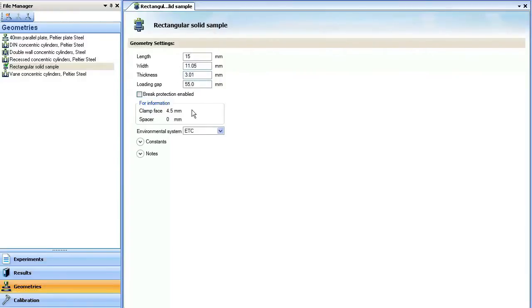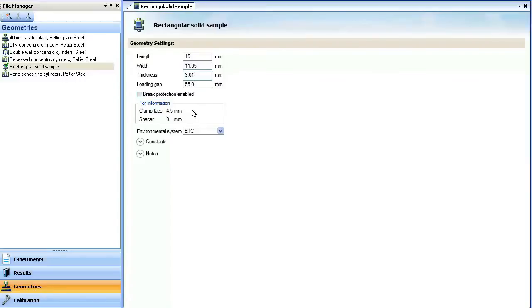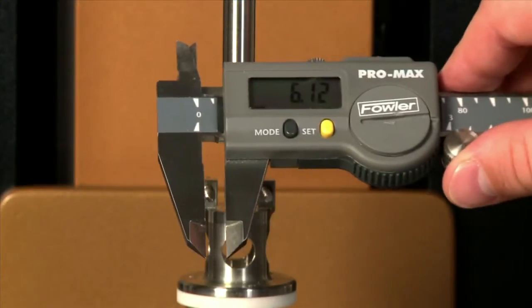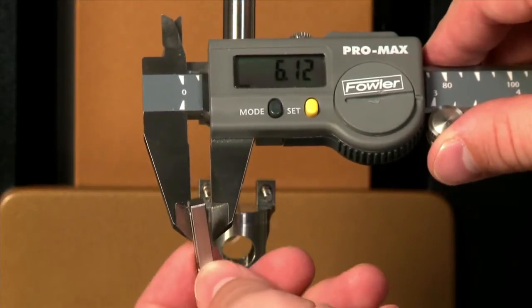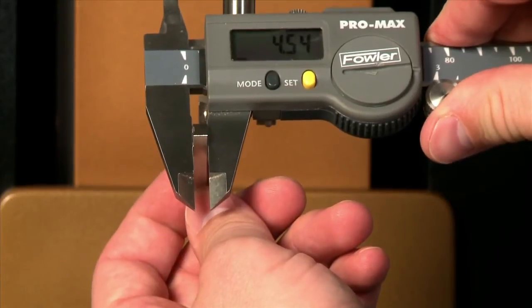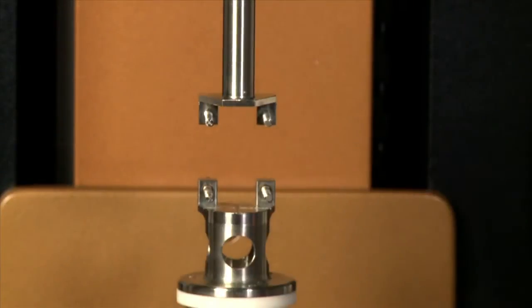Notice the For Information tab. There are dimensions of the clamp base and spacers required to mount the sample. Locate the appropriate spacer from the kit and place on the upper and lower geometry.